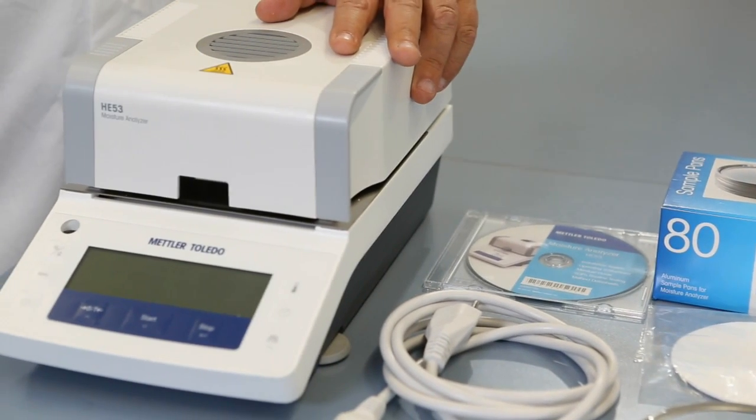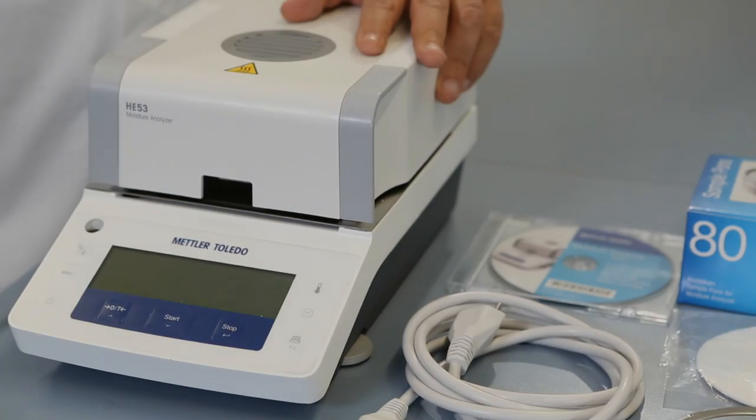And finally, the HE53 Moisture Analyzer instrument.